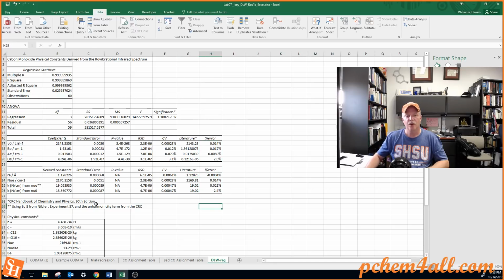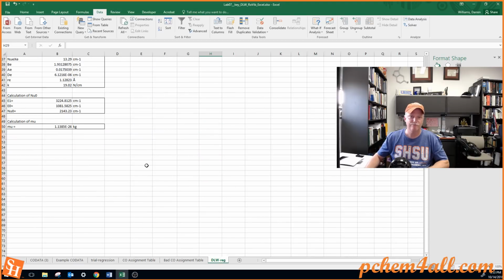So you can do all of this with the skills that you already have. You can ask your TA or me for help as well. So that's a quick rundown on some strategies for quickly peak picking your data. Okay, great.